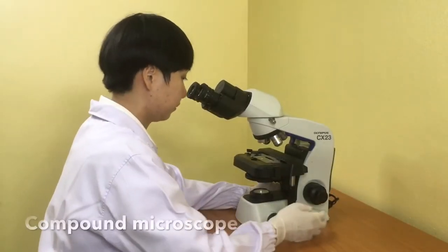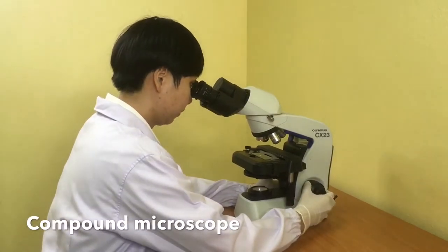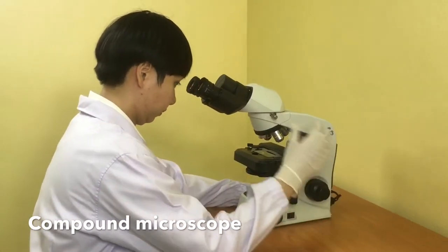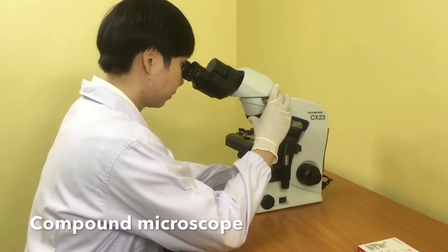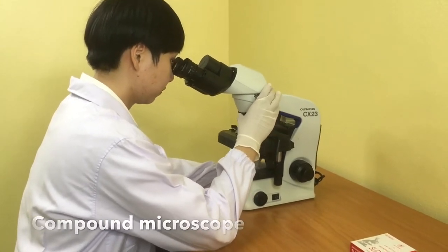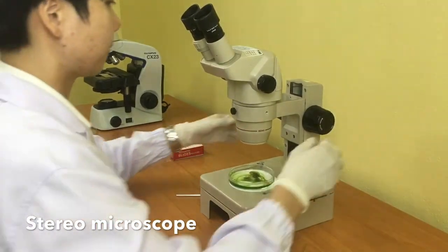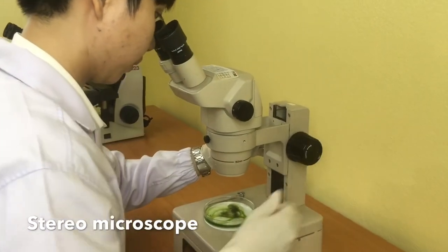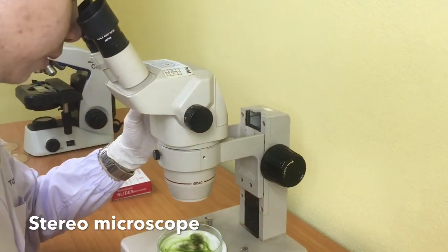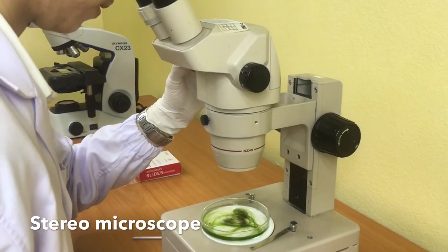After watching this video, you should be able to explain differences between a transmitted compound microscope and a stereo microscope. In addition, you should be able to name the major components of the microscopes and describe their functions.